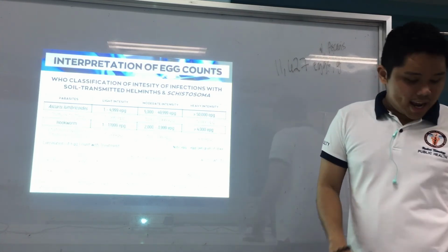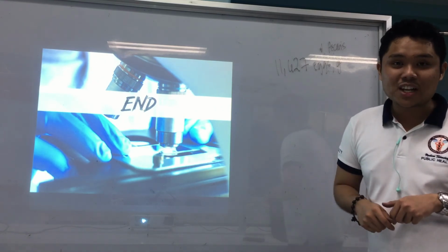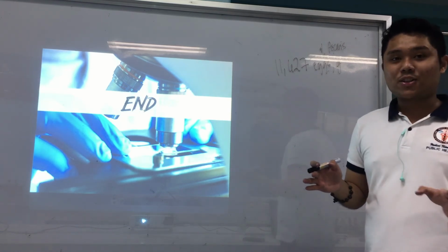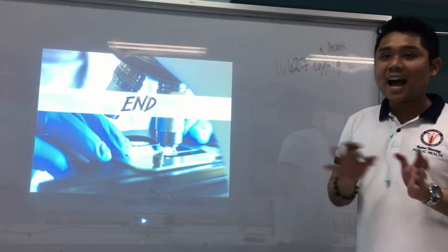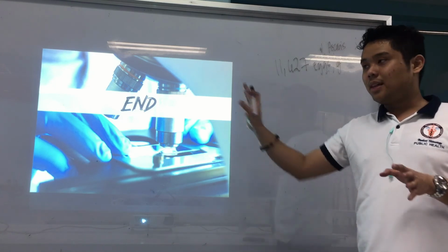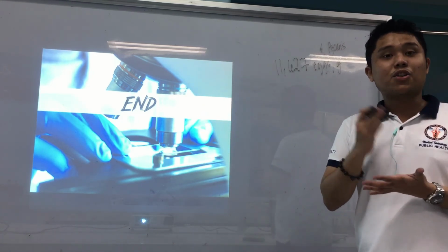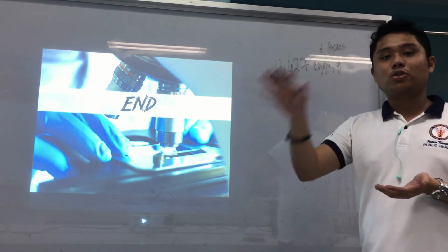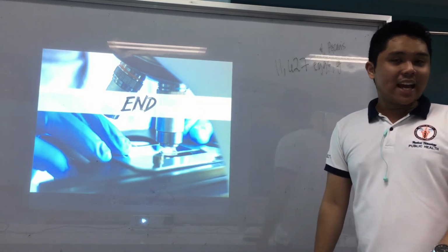All right? Okay, and that ends our discussion on the preparation of fecal smears, guys. Again, quite a lot. Those are 3 activities in one lecture. I just combined all because they have quite similar procedures and they have the same purpose. These activities are the next step after examining our stool samples macroscopically. We then go to the microscopic examination, and this is it.